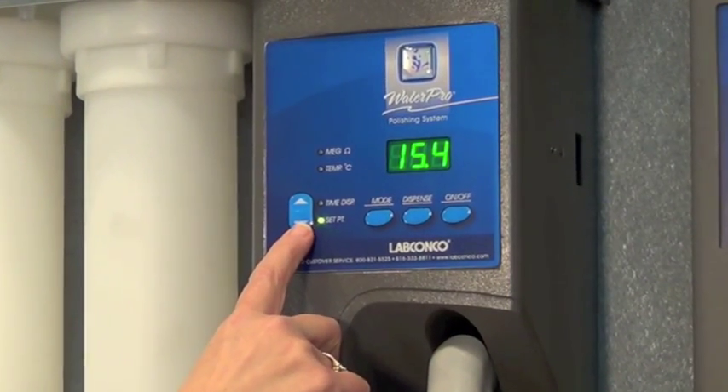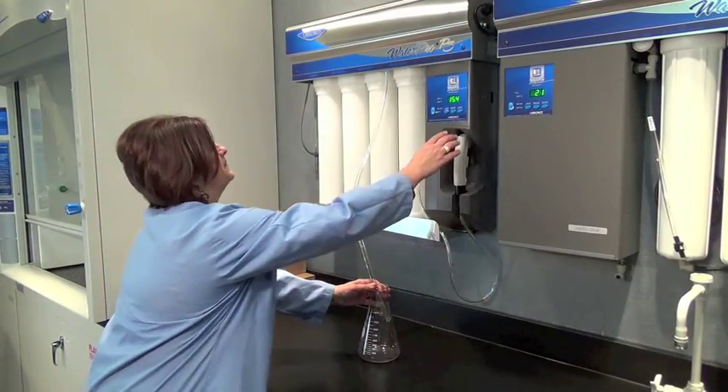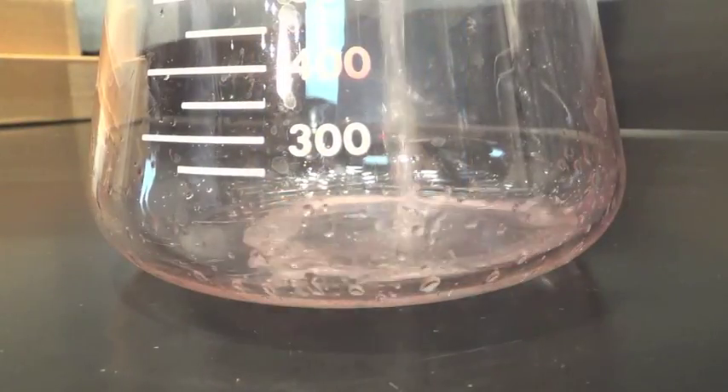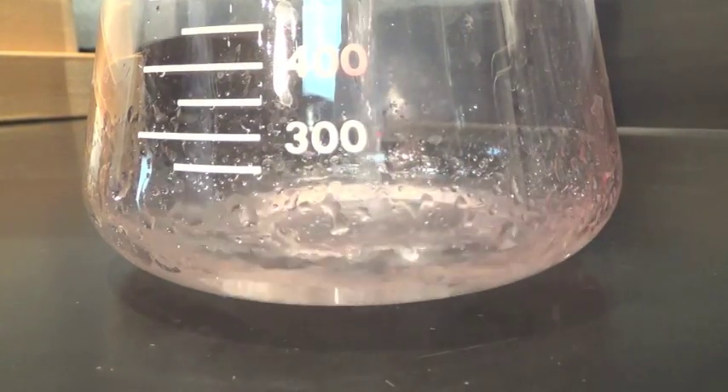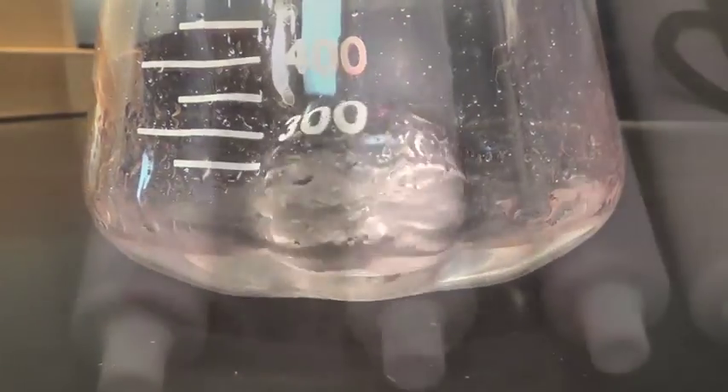The set point can be increased or decreased using the arrow keys. The display will flash if water resistivity drops below the set point. Pressing the dispense key delivers water from the dispense valve; the key must be held down to continue dispensing. The delivery will be time controlled if that mode has been selected and a value entered into the display.